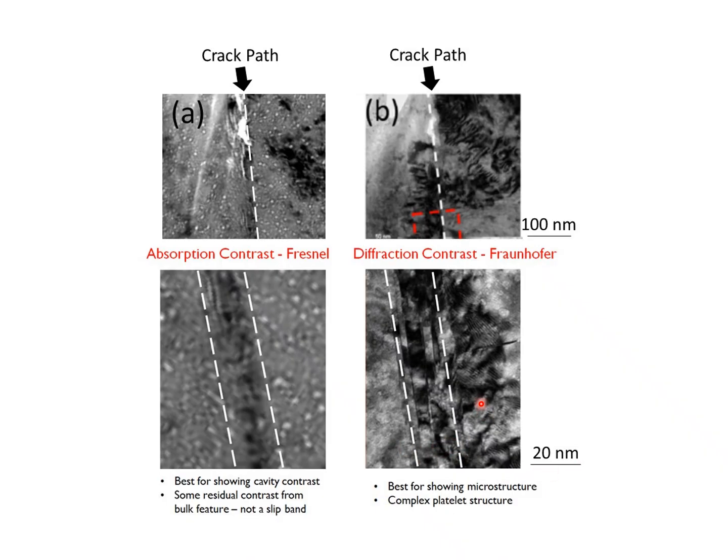You're not going to see that for a typical spot size you would use when you're doing a scan to determine where to do your microtensile test. It's not going to show up when the probe size is 100 nanometers and bigger. It just won't. You might see some vague evidence of a feature, but no, you won't see it.